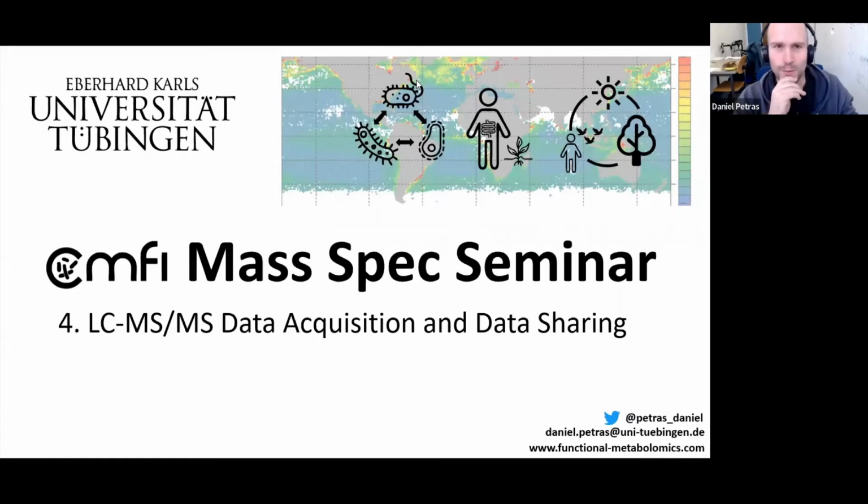So yeah, today we're going to get a little bit into practical aspects of LC-MS data acquisition, and we also prepared a little hands-on exercise to get started with our data analysis. So the first thing will be upload and data sharing.